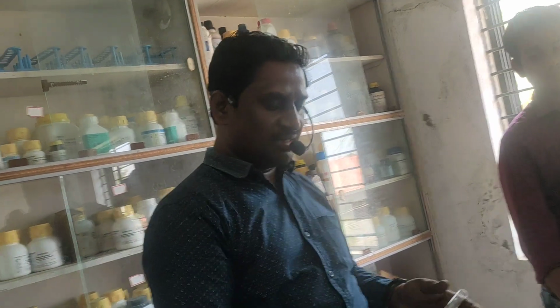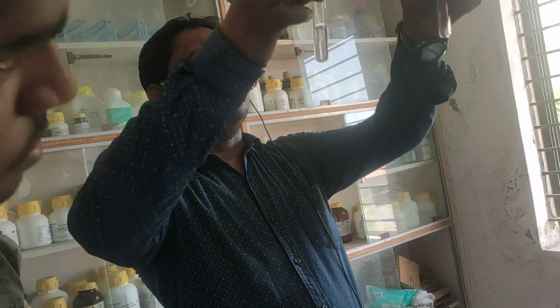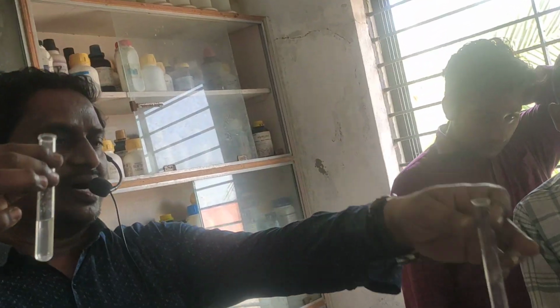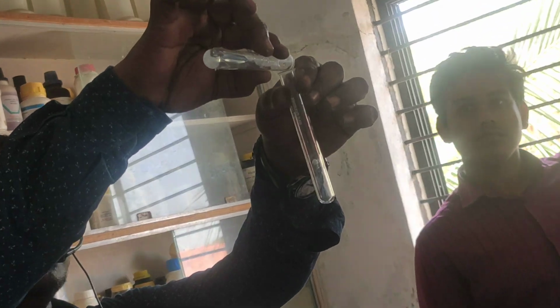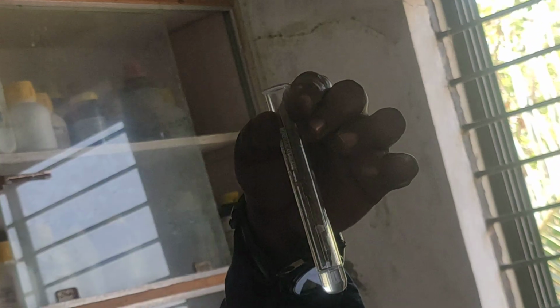So I am taking the original solution. Look here, all of you. Now I am testing for Ca2+. Ammonium oxalate is there, see. I am taking the original solution, and I am adding ammonium oxalate.